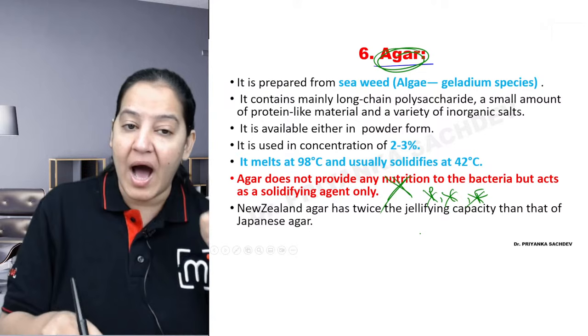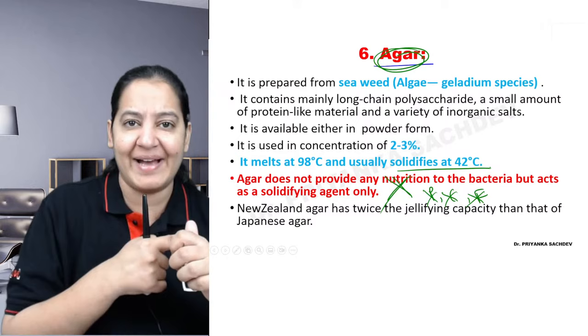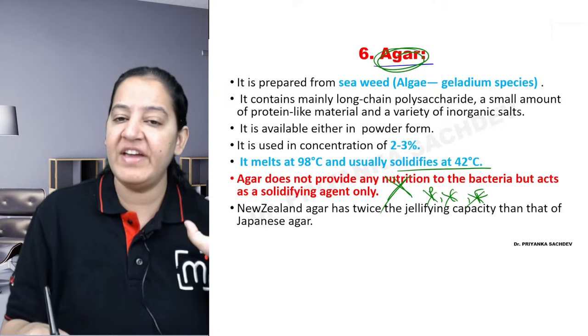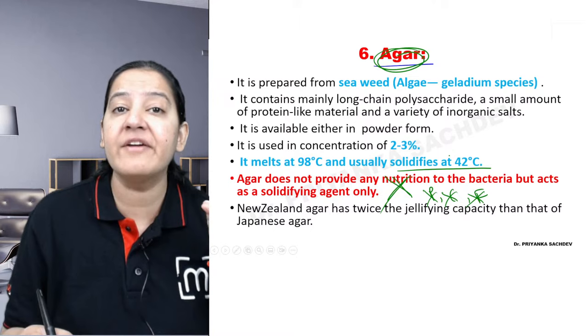These five things which I have enumerated are all liquid. Water is liquid, NaCl is liquid, peptone water, blood, meat extract, everything is liquid. To solidify them, we add agar. So basically we add agar only in solid media, not in liquid media. If you want the media to be liquid, don't add agar. If you want it to be solid, add agar. So agar is the solidifying agent.